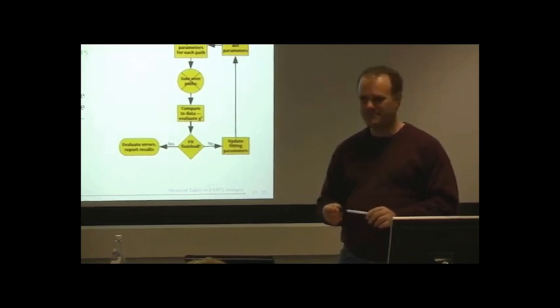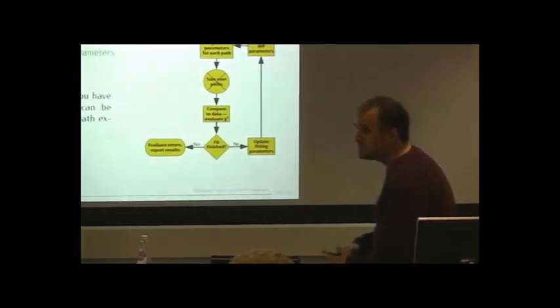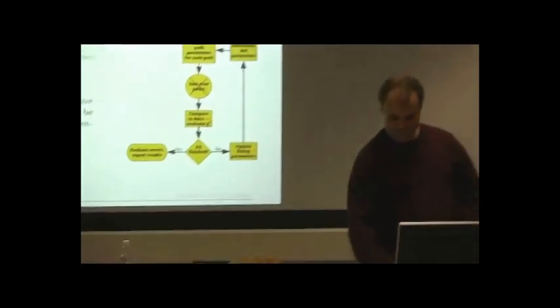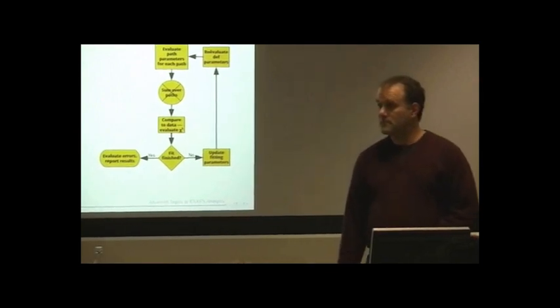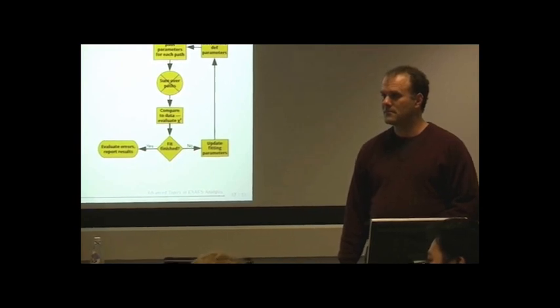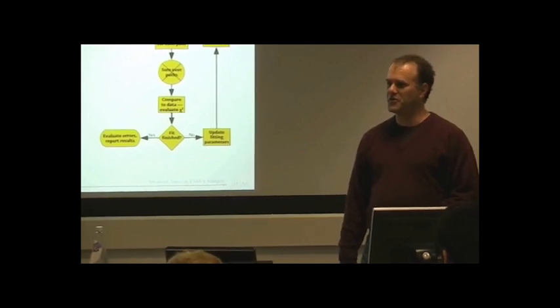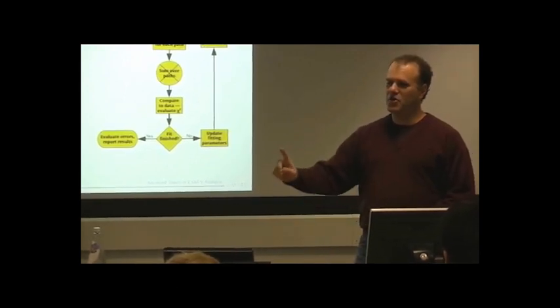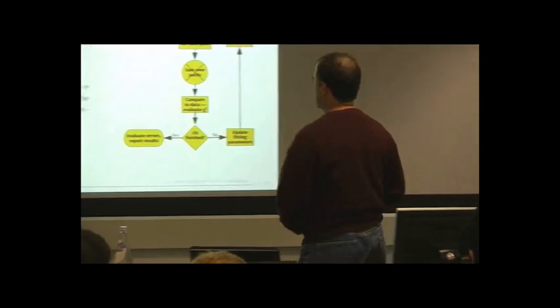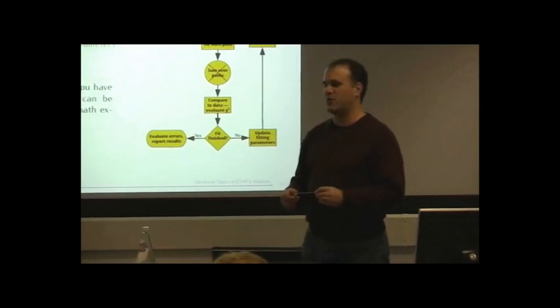Yes? On what basis did you choose the formula to calculate the number of independent parameters? For what I know, the literature represents another two options of this formula by adding either one or two at the end of it. Yes, I just decided to step out of the debate of whether it's +1 or +2. That's why I use the approximately equal. So the formal statement, if you go way back and look at the early signal processing papers, it's +1.